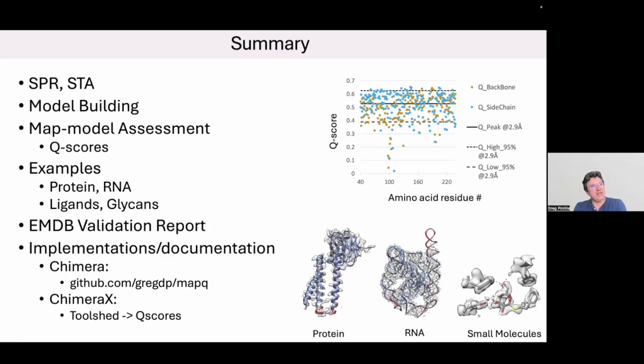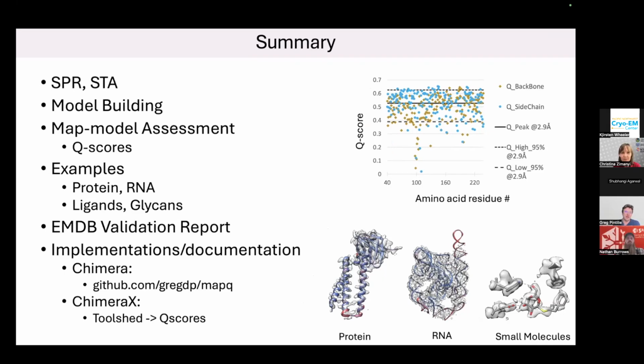Yeah, you could, and that's actually the first thing I tried when I was fitting Gaussians to the atom profiles. I thought, oh, I can just fit a Gaussian, and then I'll know what the resolution is for that atom. It worked okay in a lot of cases where the atoms are well defined, but if the atom is not well defined, then fitting a Gaussian didn't work so well. It wasn't very robust. The other caveat is that if you have a very sharp peak, you might think the map is so well resolved, but that could also potentially be noise.